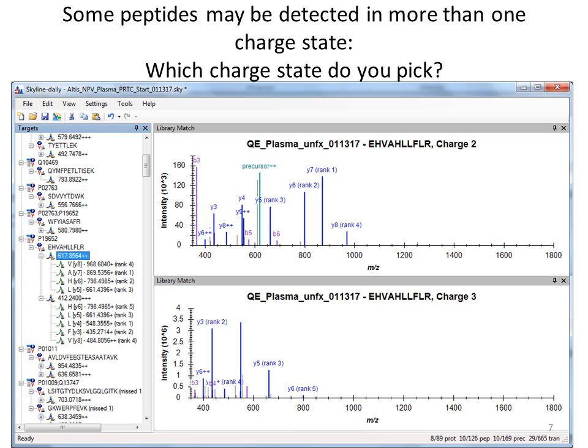And so I had to figure out which peptides to target. So I took all the peptides that were identified, the entire list, which was way too many to do on a triple quad all at once, or at least with the time I wanted to spend. And I sorted them according to intensity, and I picked like every 10th peptide, so I had the entire range of intensities that were identified in my spectral library. And then I took those peptides with their protein names, and I imported them. And I'll show you how to do that in a little bit.